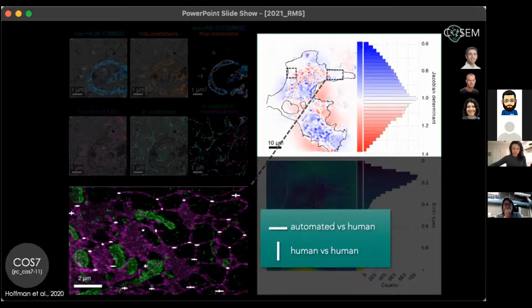However, over here in the bottom, you can see where the ER gets, where there's not as clearly defined ER structures to align. John and I had more disagreement with each other because it's more ambiguous as to what we were going to be aligning. And then, but conversely, I guess, or mirror to that, if we look at how we did comparison to the automated registration.